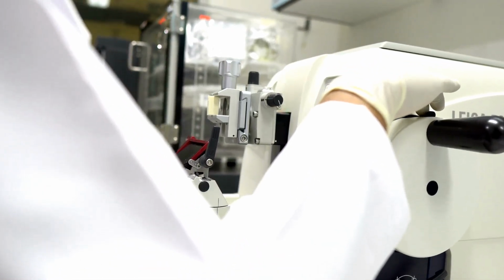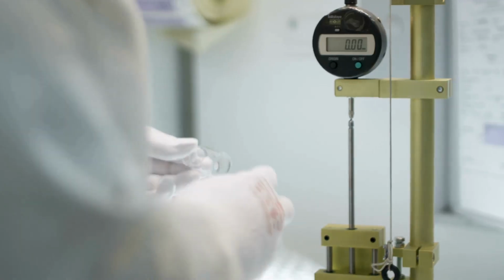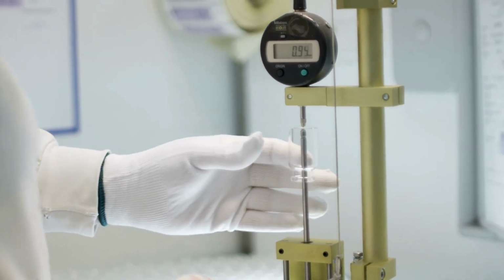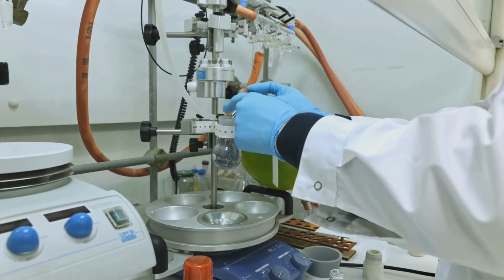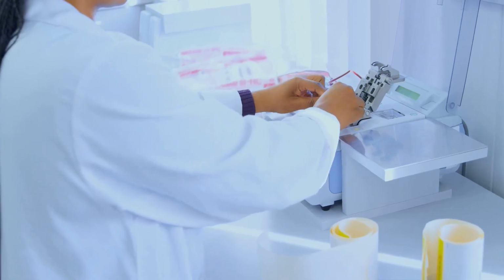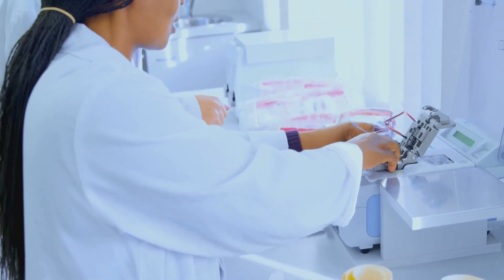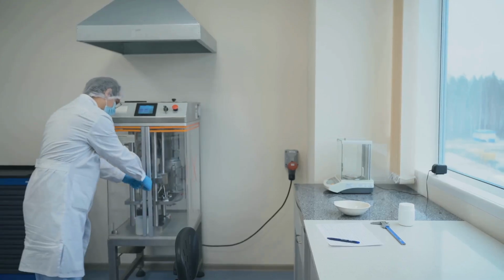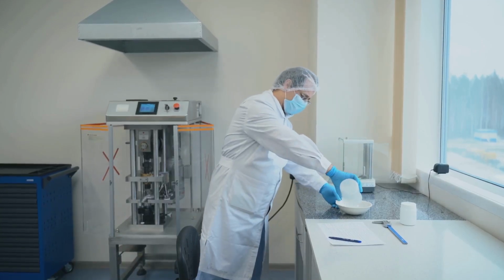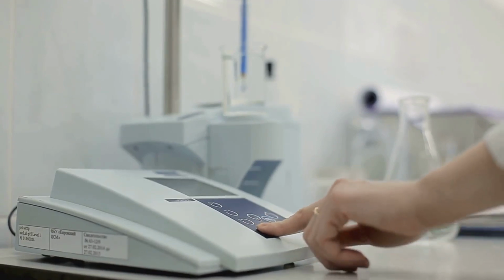Calibration is essential for ensuring that analytical instruments provide accurate and reliable results. So, let's break it down a bit. Purpose. Accuracy. Verify that instruments measure correctly and produce reliable data. Maintenance. Ensure that instruments remain within specified performance limits. Procedure. Standardization. Use certified reference materials to calibrate instruments. Documentation. Record calibration procedures, results, and any corrective actions taken.